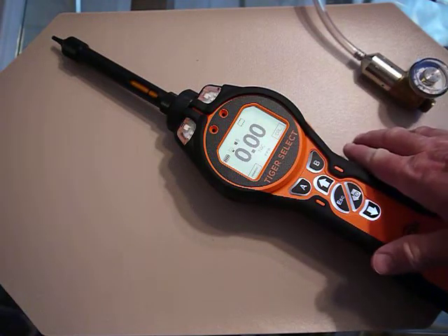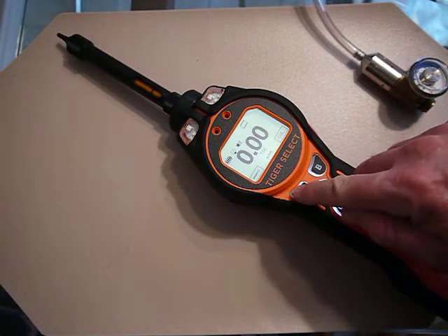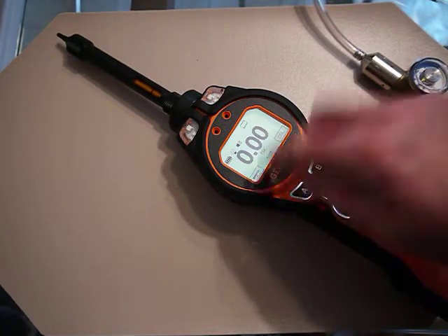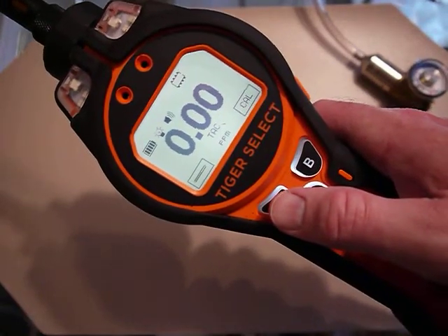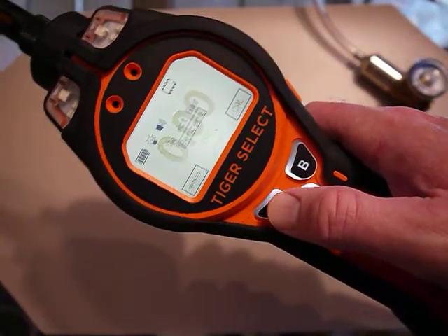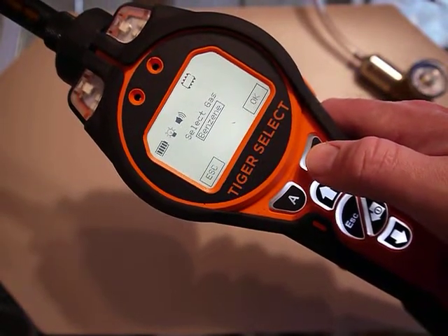I would let this warm up for at least 15 minutes before taking a measurement. I hit the tube button — there's a tube here — and select the gas, which is benzene, because that's all we're really trying to measure with this.